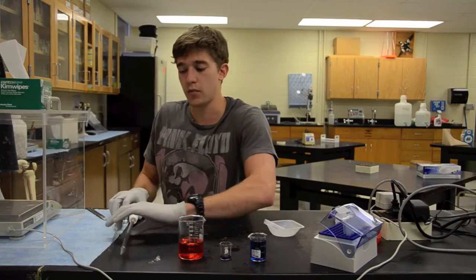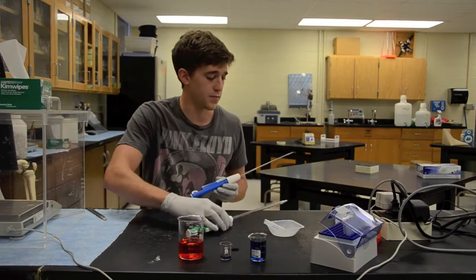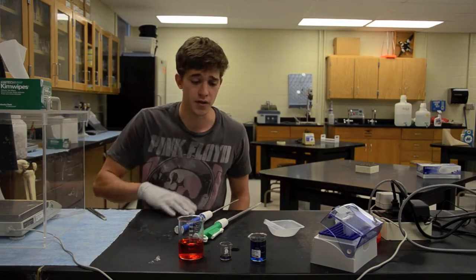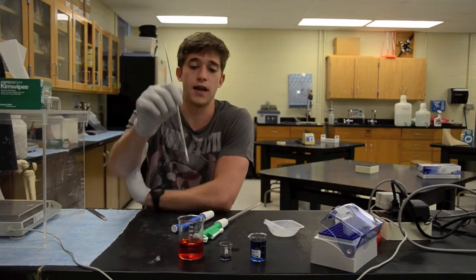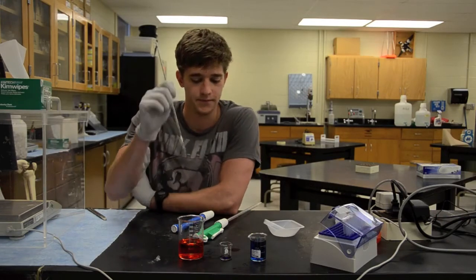Now, you also have to remember to use sterile technique with this. It is always important when using these to hang them off the edge of the table. This way they will touch nothing else to become contaminated. You might think, well, I'll just put mine, like so, in a beaker. It's a good way to put your neighbor's eye out, so don't do that.